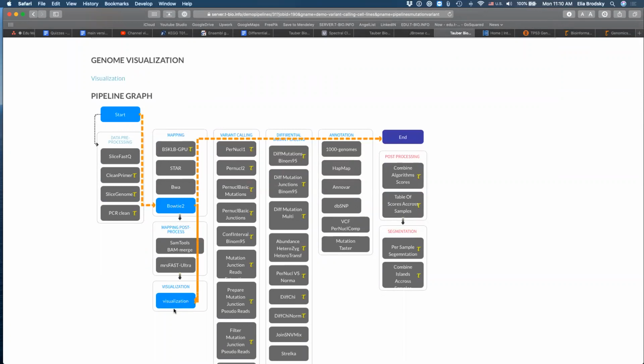What kind of a data do I use for this pipeline? I use the exome-seq read file, which is going to be a FASTQ file. What is going to be mapped? What is the mapping file that I'm using? I'm using FASTA file, which is a file of the sequence of the human genome, and an annotation of that genome. So where are those positions of genes?